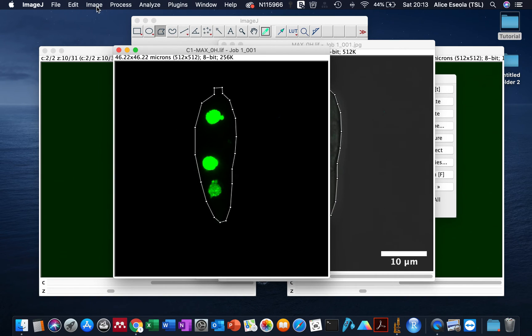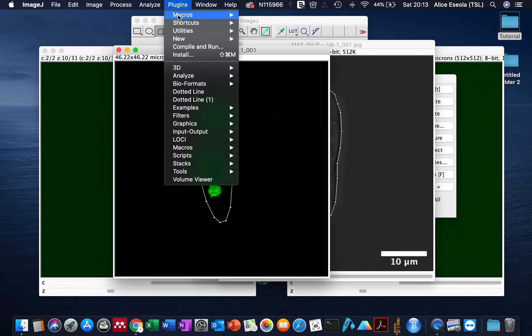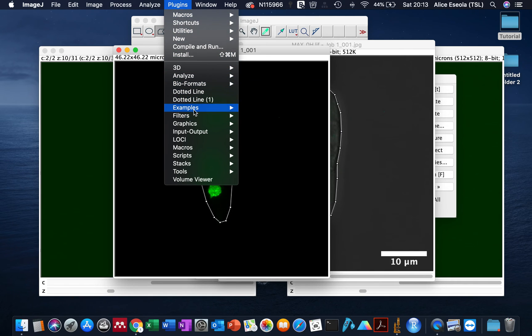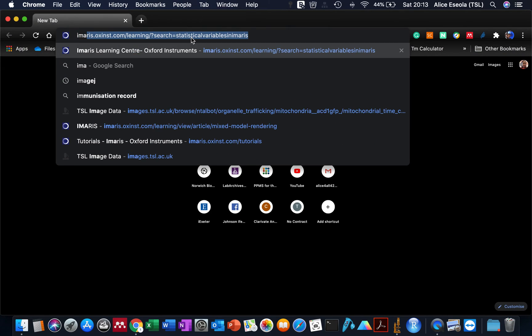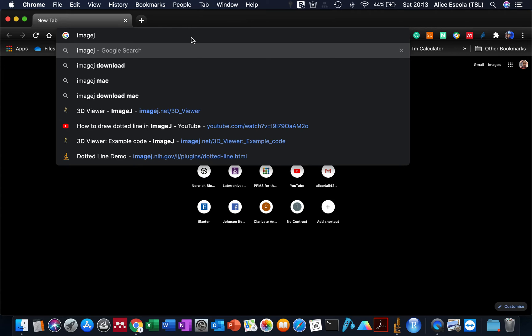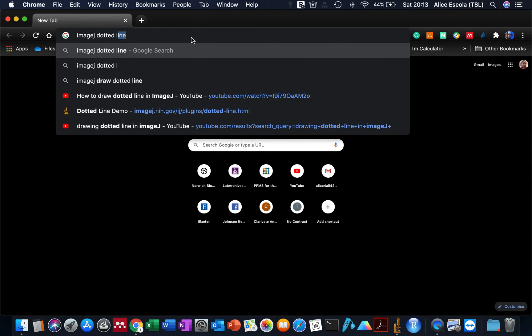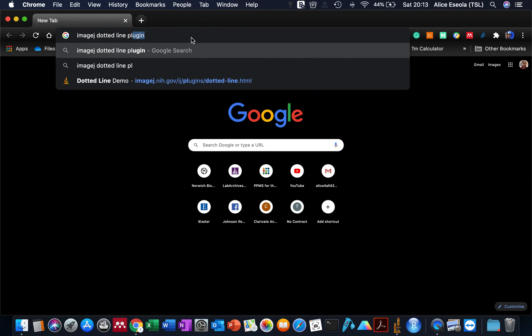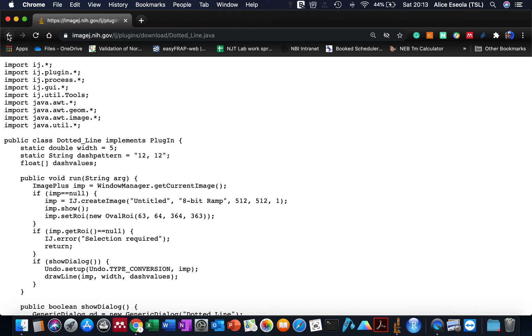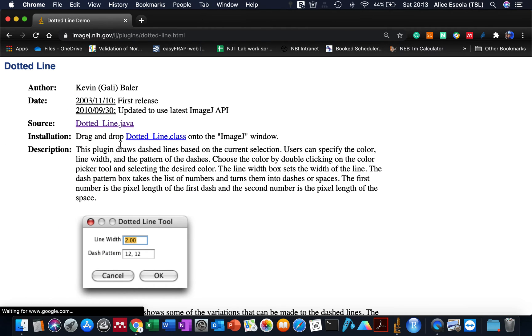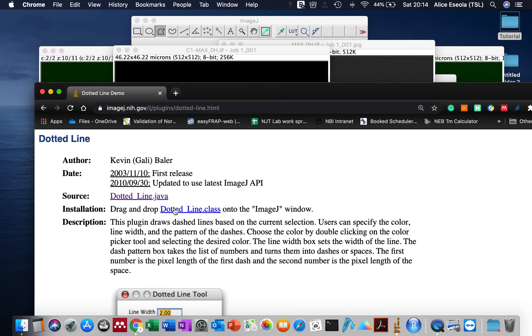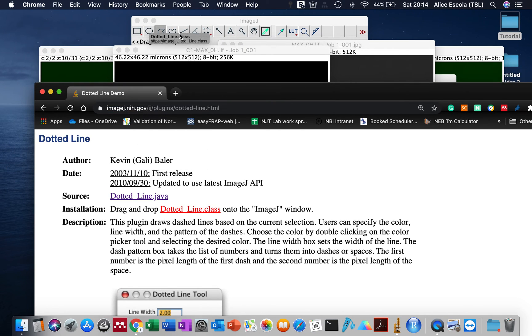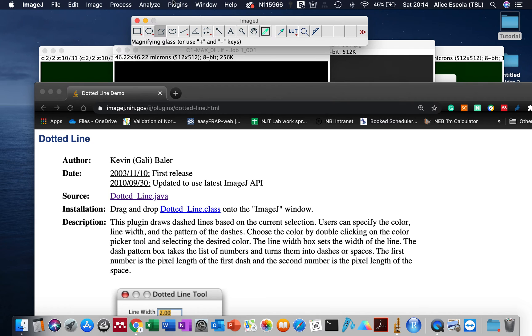Now all we have to do is go to the plugin. Because I already installed the plugin for the dotted line, it will be in my plugin folder. If you haven't done this, all you have to do is search the internet for ImageJ dotted line plugin. It's really easy because once you find it, all you have to do is drag this file into your ImageJ. It will ask you to save it, and automatically you'll be able to find this in your plugin.